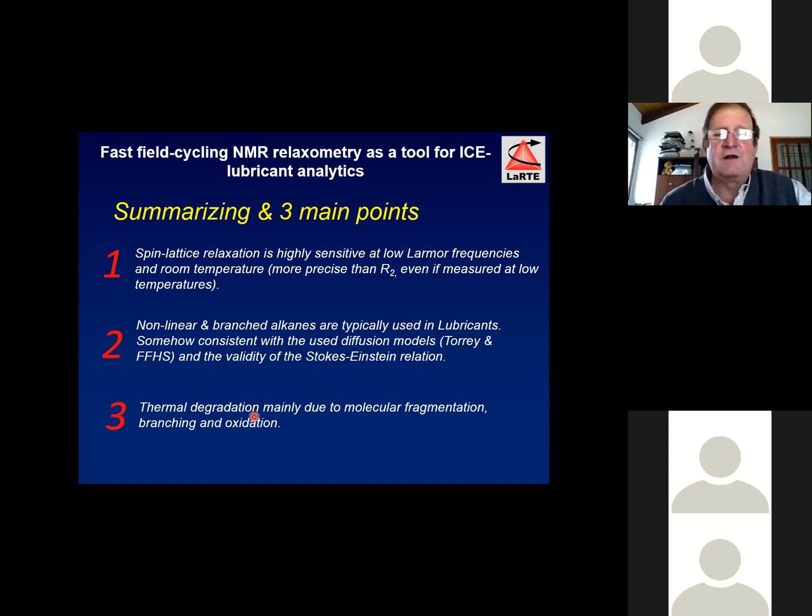Of course, there is still a long way to go to end with a final analysis using NMR relaxometry of what is going on at the fine molecular level in the lubricant, but as a technique for fast testing of the degradation it is very efficient because we can have a result in a few minutes, and this is interesting.